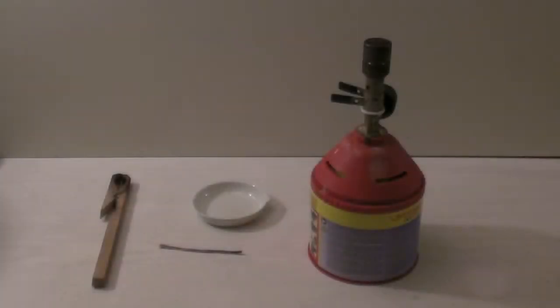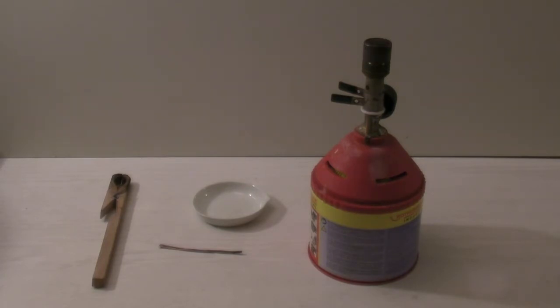For the Beilstein test the following equipment is needed: a Bunsen burner, a copper wire, a clamp or tongs to hold the wire, and optionally a porcelain dish to hold the sample. In addition to that, the test is done in low light conditions.